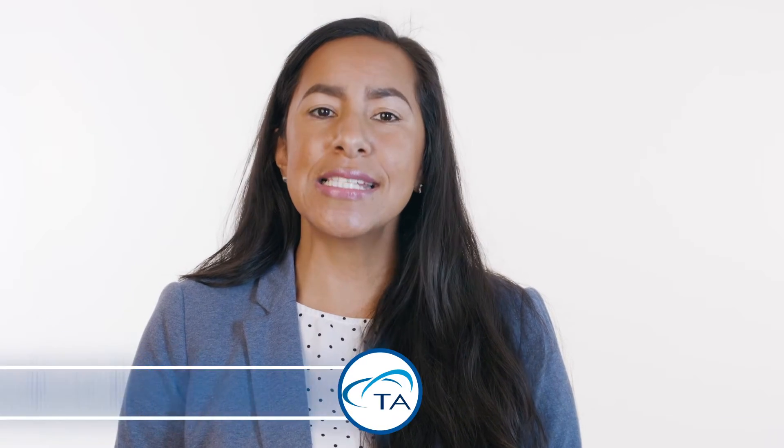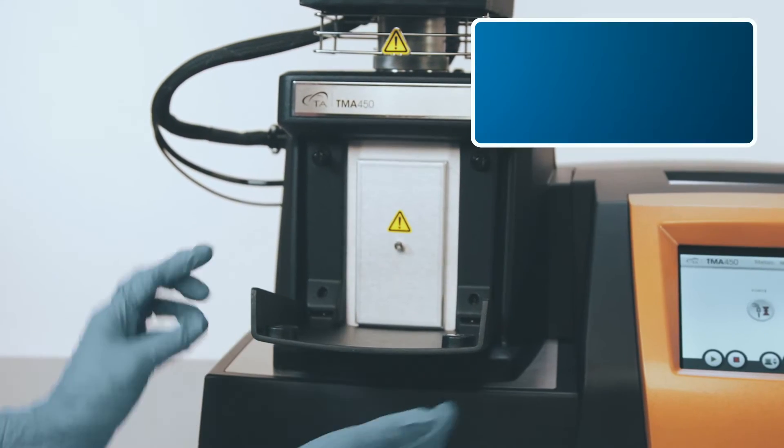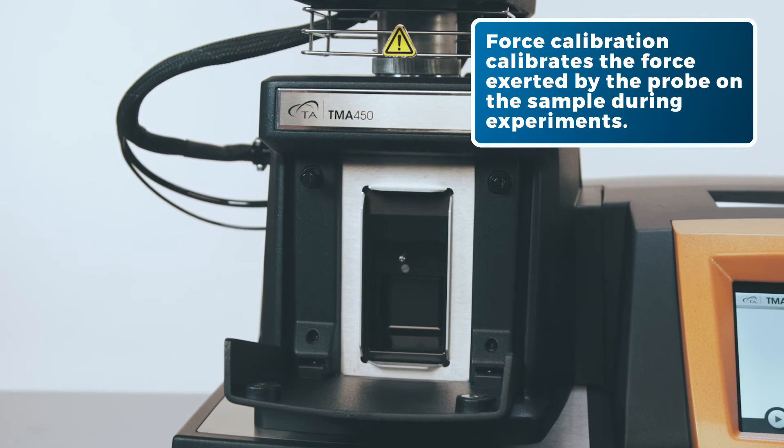Hello and welcome to another TA Tech Tip. In this Tech Tip we will show how to perform force calibration on the Discovery TMA 450. Force calibration calibrates the force exerted by the probe on the sample during experiments.